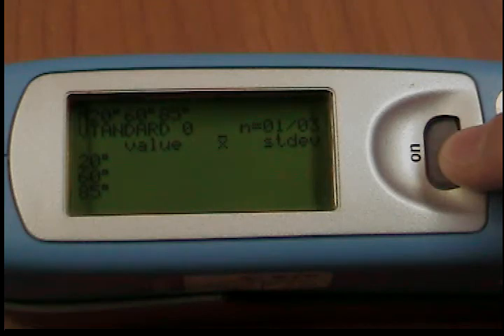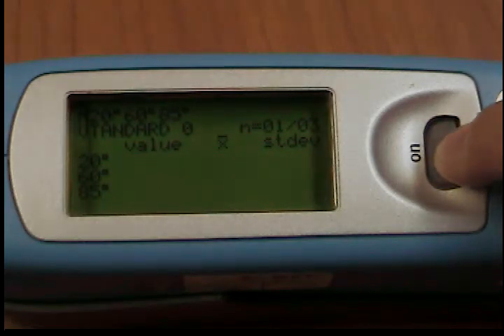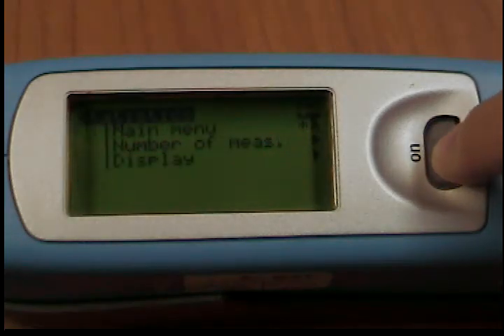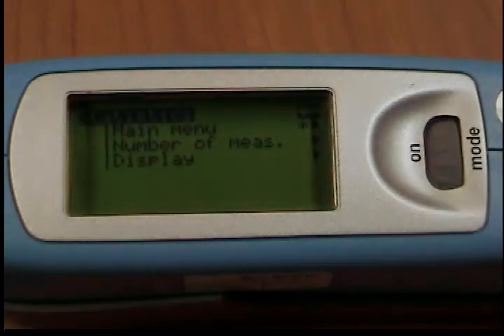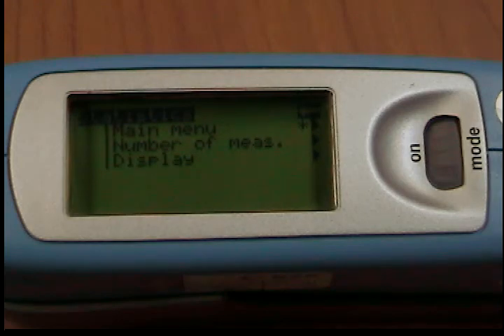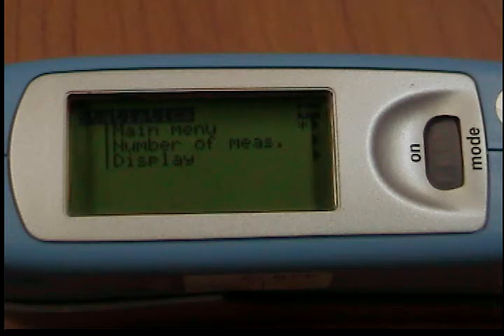Save and Difference: When Save is turned on, a name is suggested after all measurements of a sample. You can confirm this name or directly change it. When Statistics Function is turned on, additional functions are available depending on the context after you press the scroll wheel.